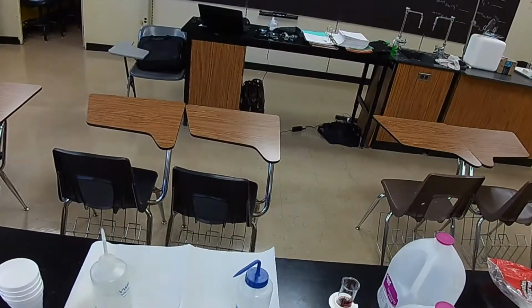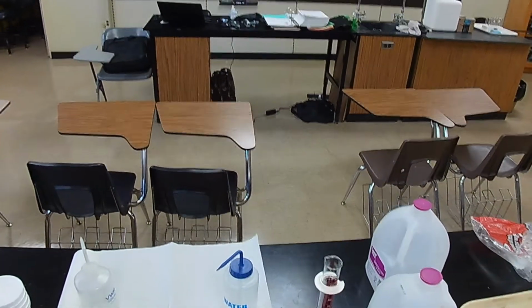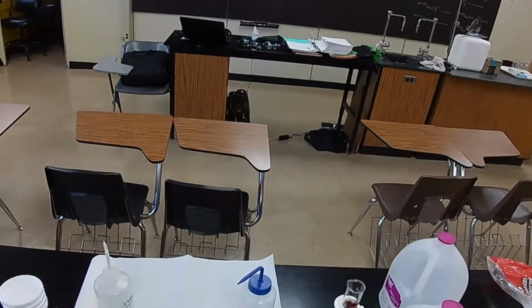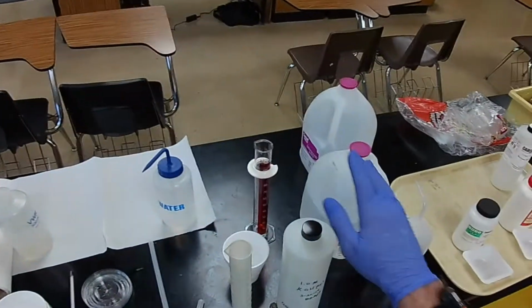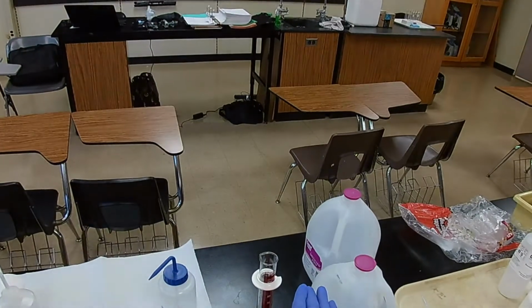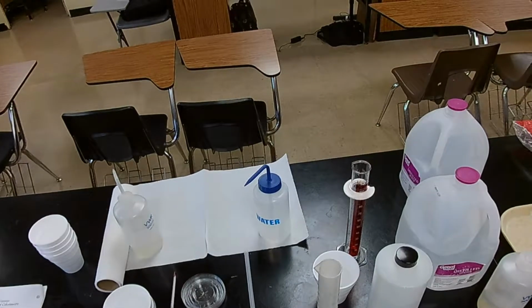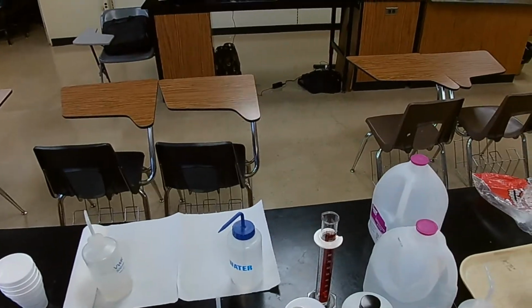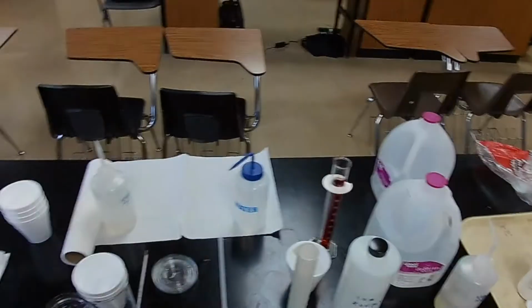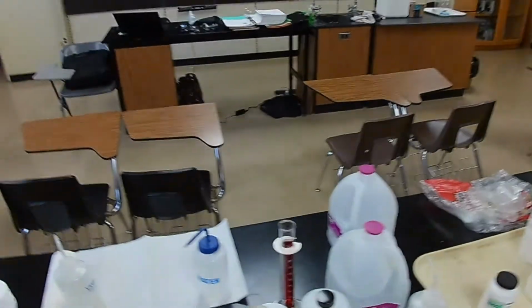Experimental error. If you want the reaction to be complete, you need to have an excess of one of the reactants so that the limiting reactant is completely used up. So we're going to make potassium hydroxide, our limiting reagent, at 50 milliliters, and we make our excess sulfuric acid at 60 milliliters. So when you add them together, there's plenty of acid to completely neutralize the potassium hydroxide, and we get a complete reaction.